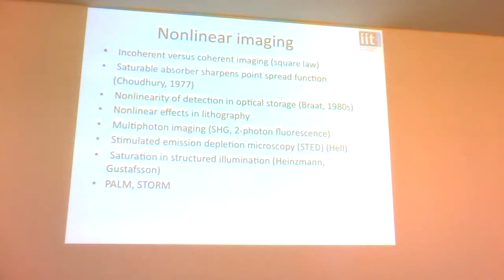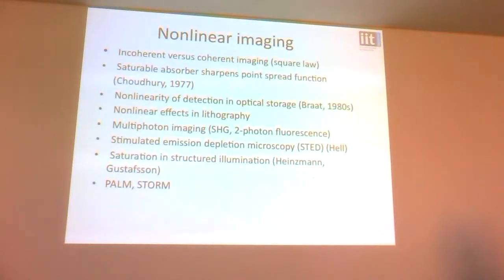Using nonlinearity has been well known for a long time in things like lithography, optical data storage and so on. The fact that you can exploit nonlinear effects to improve resolution. Multiphoton imaging, if you do SHG or 2-photon fluorescence, you effectively get the resolution of the output light, not the input light.